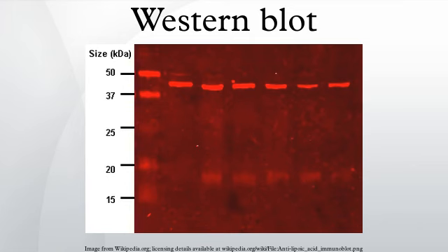The primary method for transferring the proteins is called electroblotting and uses an electric current to pull proteins from the gel into the PVDF or nitrocellulose membrane. The proteins move from within the gel onto the membrane while maintaining the organization they had within the gel.